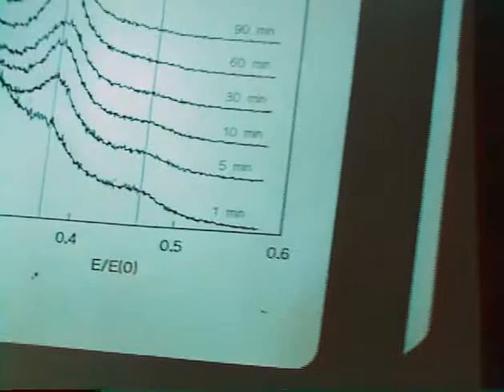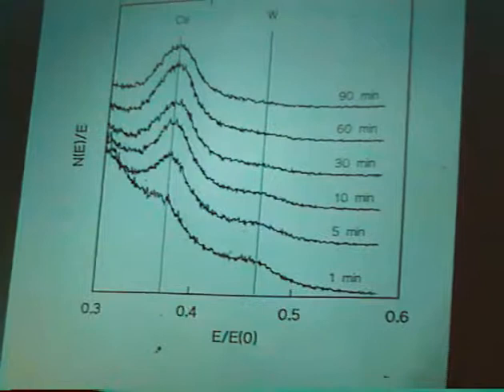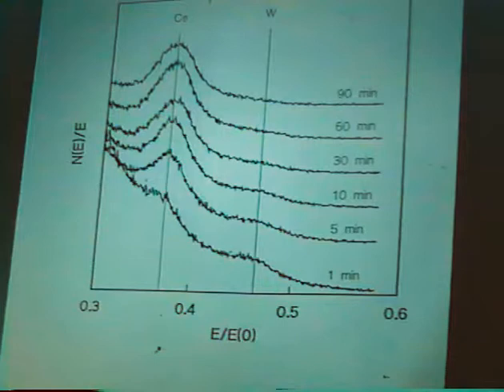Now, I would like to give you one other piece of evidence, not from Raman spectroscopy, but from ion scattering spectroscopy, for the presence of this film and for the covering, not so much the molten film, but the covering of sodium tungstate on cerium oxide. And ion scattering spectroscopy is strictly a surface sensitive technique. Using ISS, we have been able to detect both cerium ions and tungstate ions using argon ion bombardment of the surface, measuring the energy of the exiting argon ion.